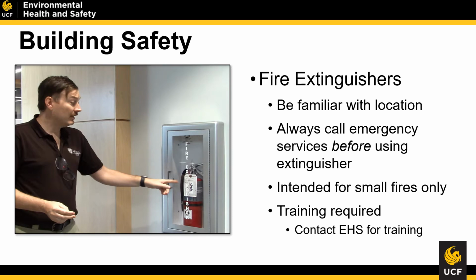Fire extinguishers do need training to use them. The technique that's usually used is the PASS. We do have training provided to you from our fire safety crew. So please, if you'd like additional training, reach out to the EHS department so that way we can offer that to you.